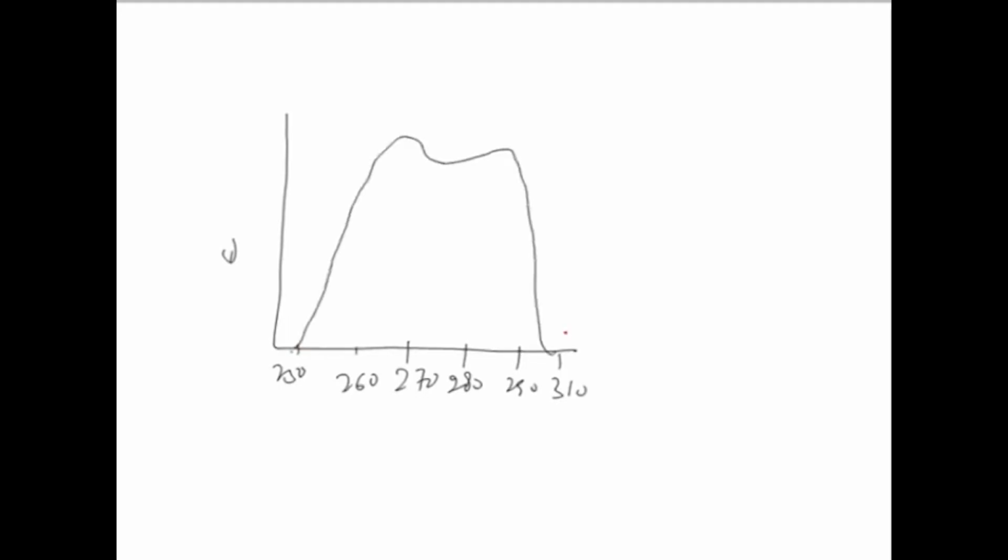Likewise, polarity, or orientations, will also affect things. For example, if solvent polarity has to be looked into, let us see how it affects the absorption. These are not very exact figures, but you can at least rely on them for understanding. So, these are two spectra here.